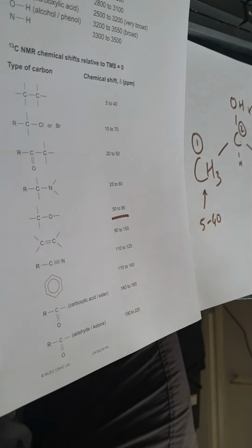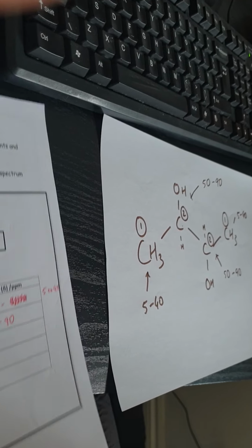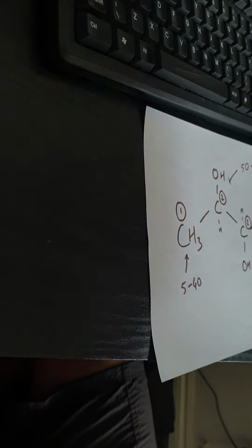Okay. So now, if I look at the spectra, we're looking for 2 peaks, and we're looking for peaks between 50 and 90, and 5 and 40.